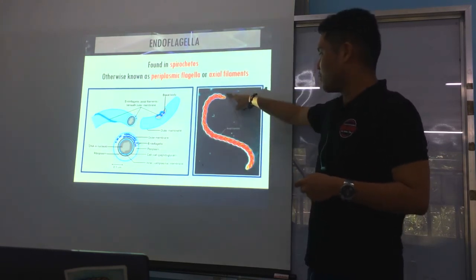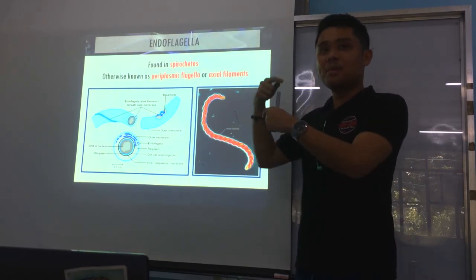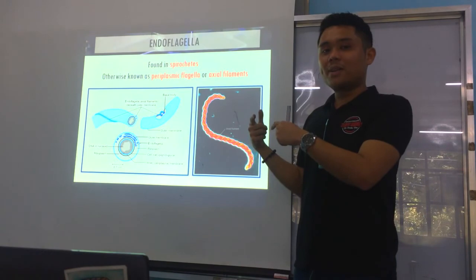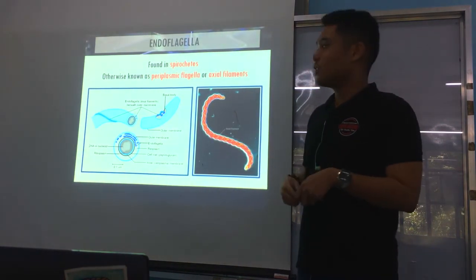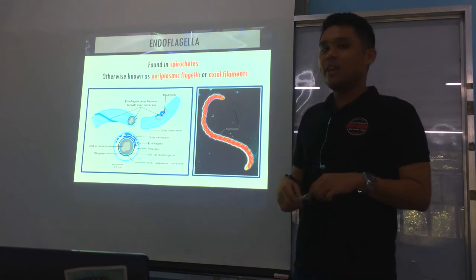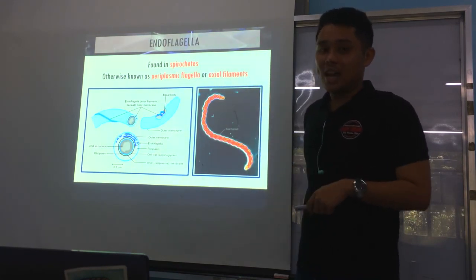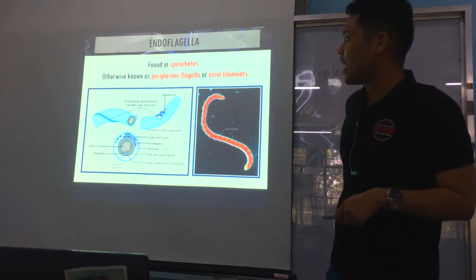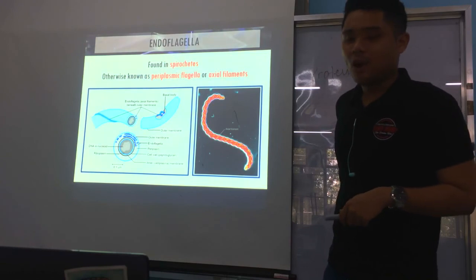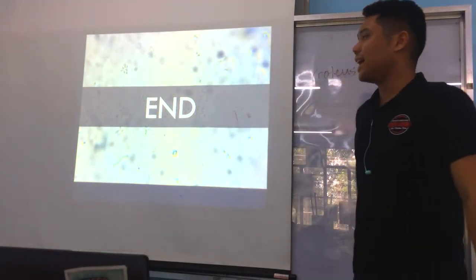So kung sa movement niya from here, ma-influence niya ang other, spiral in motion, if you move one end, move sila together. Okay, so muna siya yung movement sa mga spirochetes because of their endoflagella or periplasmic flagella. Okay? Alright, okay. So again, they're also known as your axial filaments. Okay, alright. So that's the end of hanging drop motility.